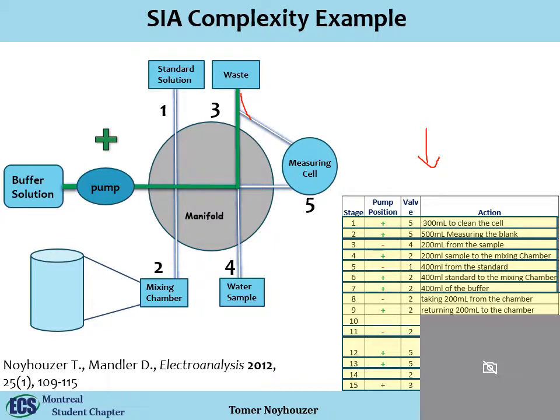And again, it looks like hard work, but after I finished this protocol, I had a protocol that I can always use. The only thing I needed to change is the amount I'm taking from my sample or from my standard. And I can repeat that measurement many times. And what I did is basically press play.